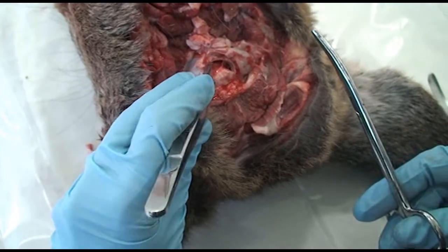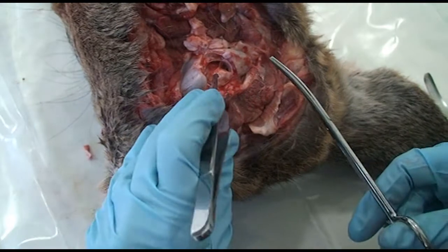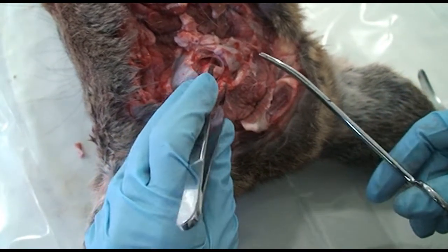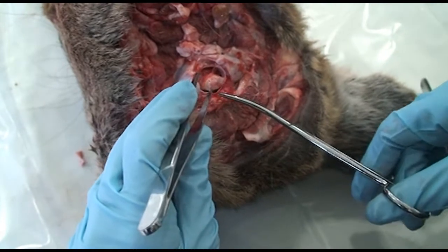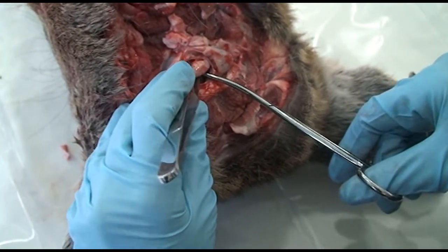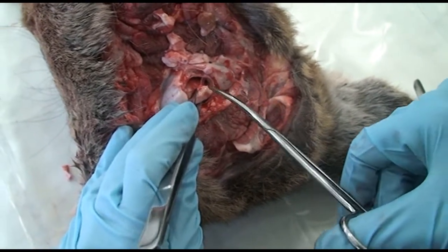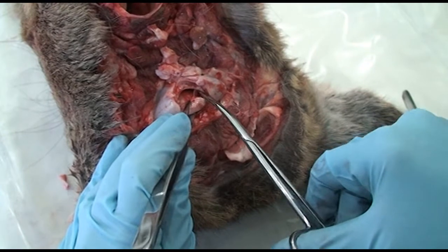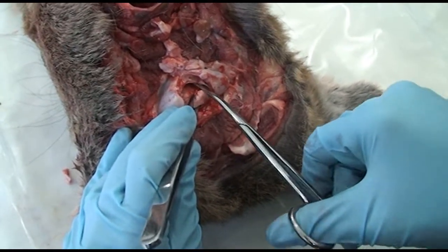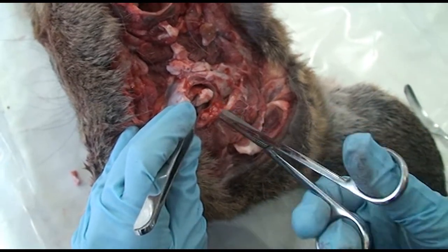So when you grasp your brainstem, if you just keep coming at it and grabbing it like this, eventually it can break it down and tear it apart, and then you'll have just mush. You won't have anything left to hang on to. So when you grasp the brainstem, try to come at it a little bit from a sideways motion and be very gentle with it, and slide your scissors in, keeping them to the outside, and you can open them slightly and just cut those cranial nerves.